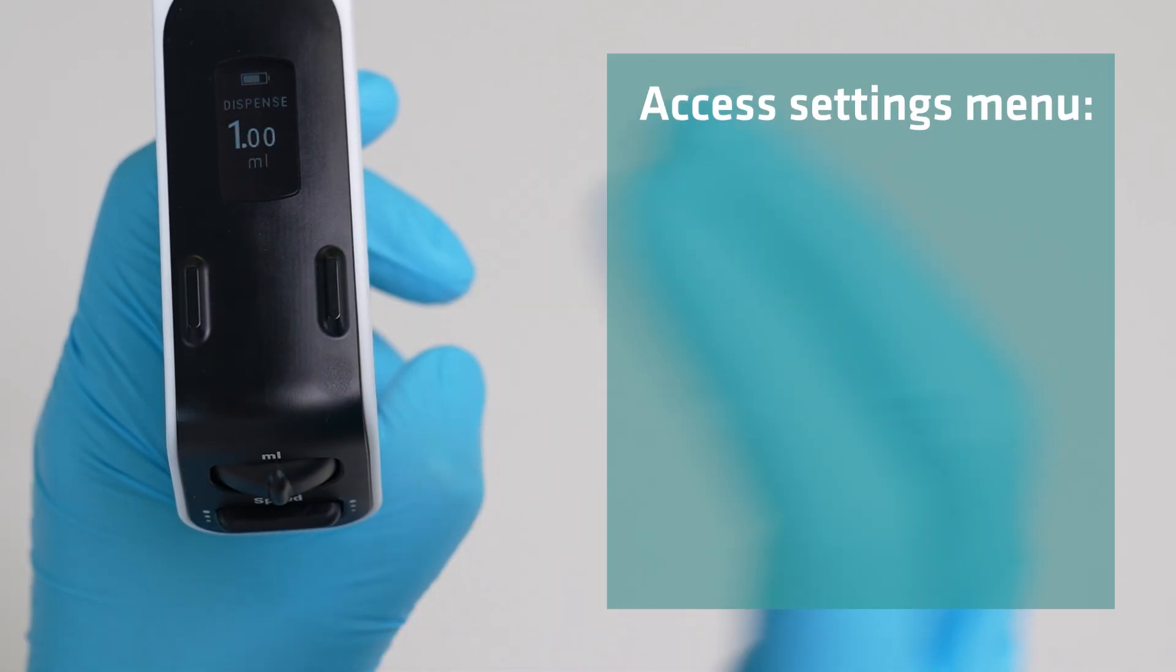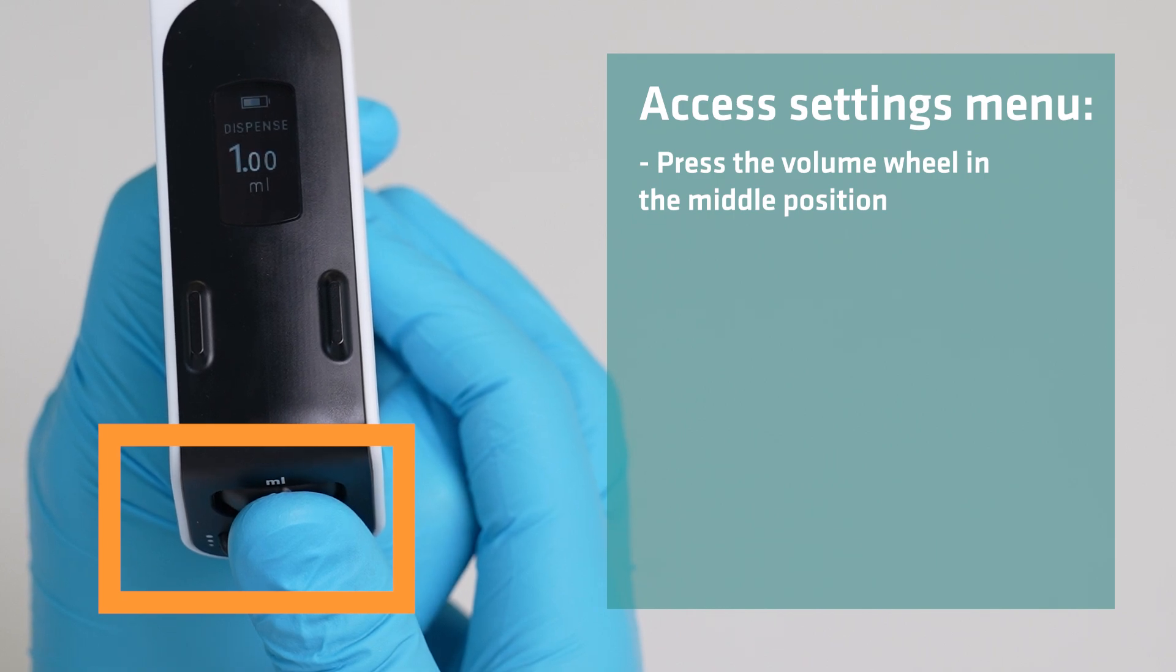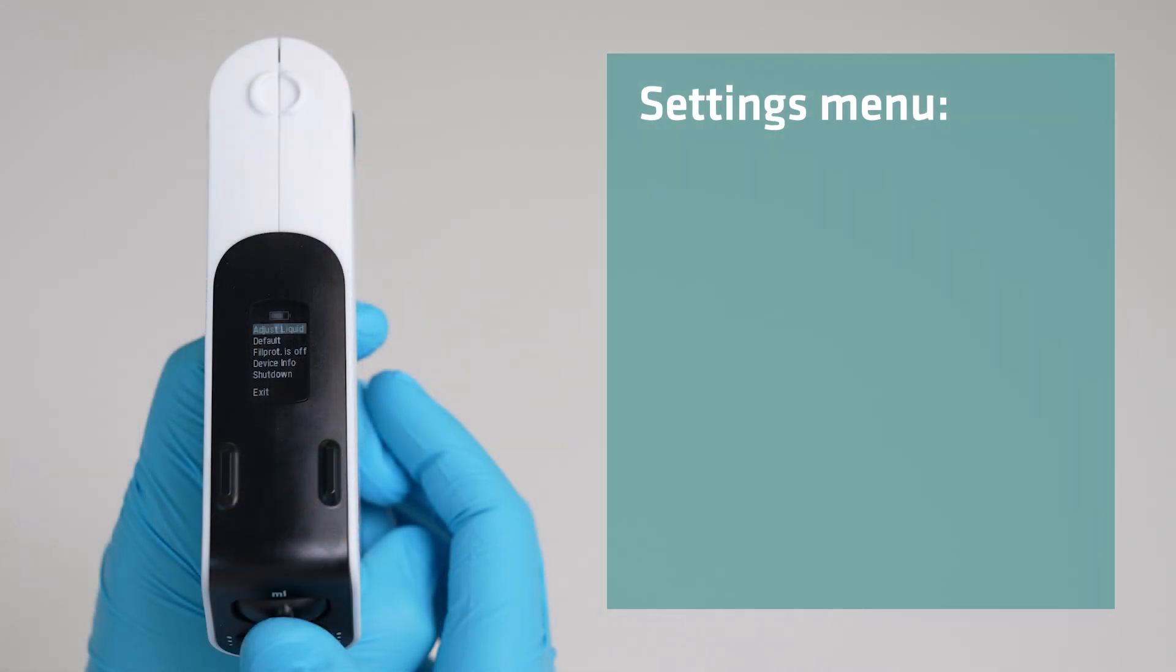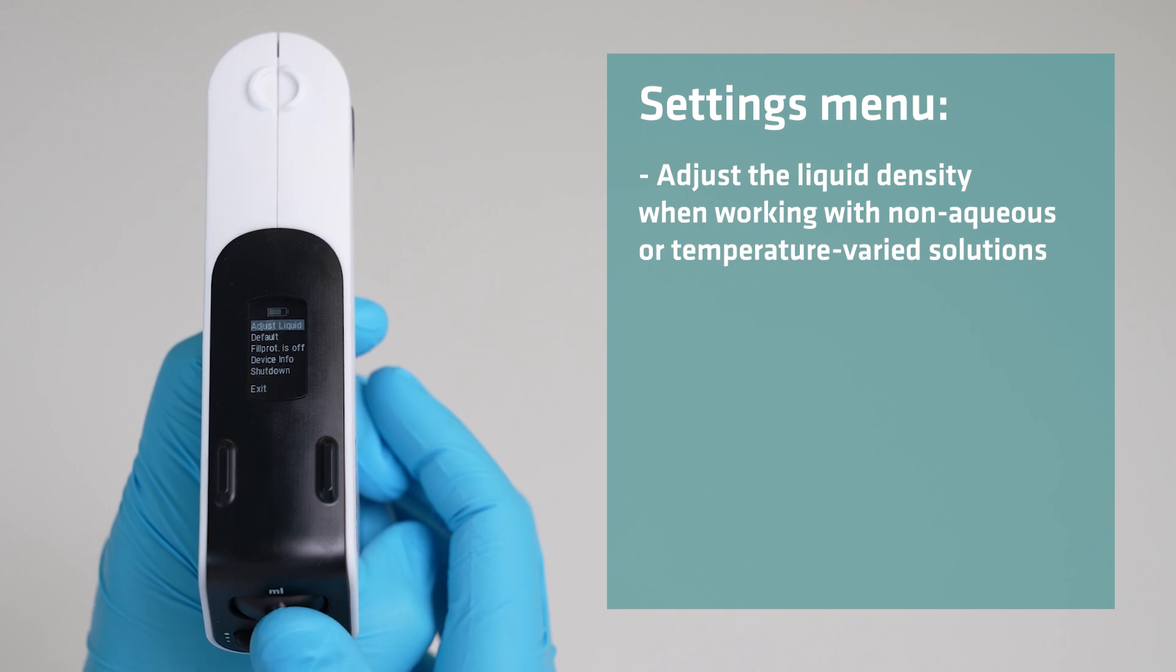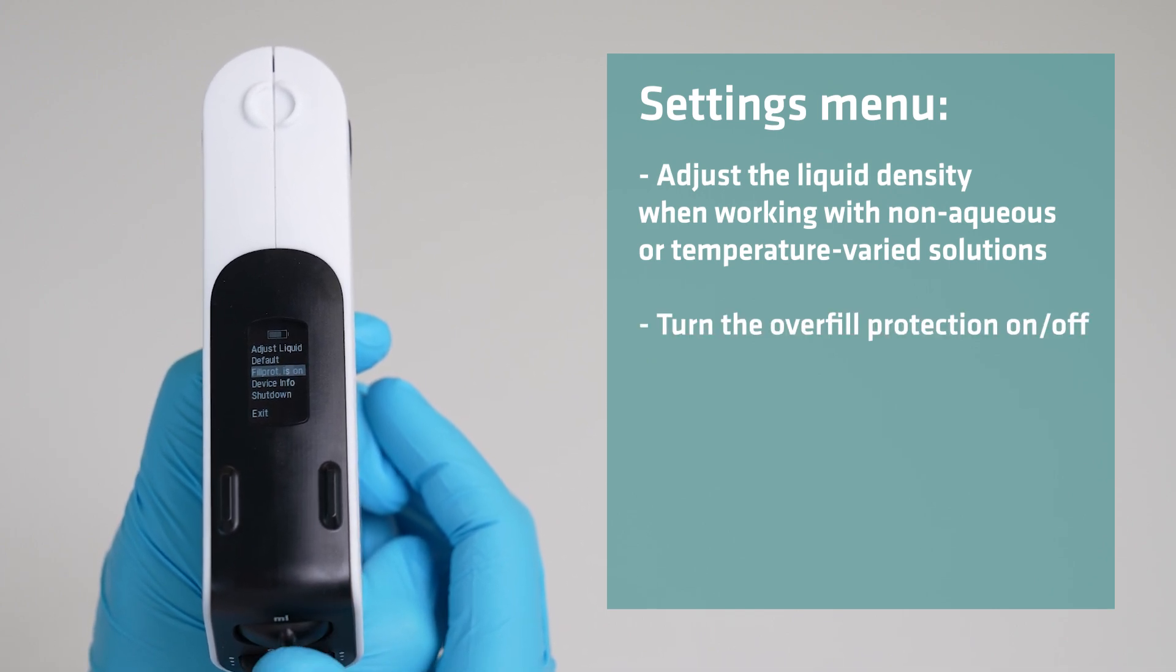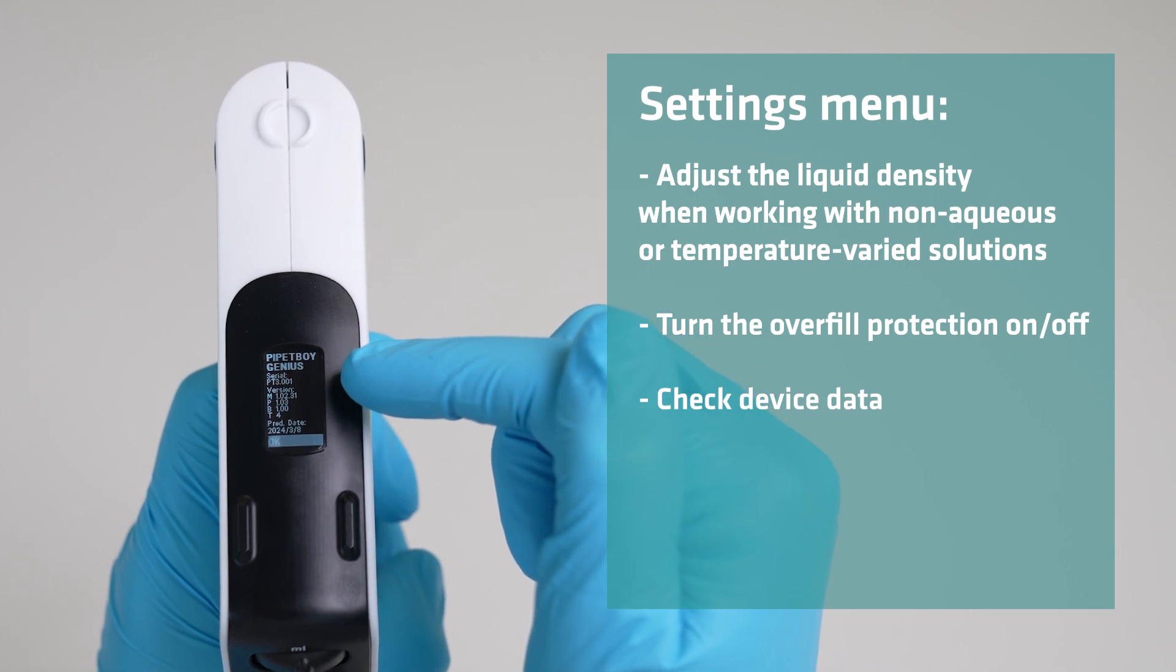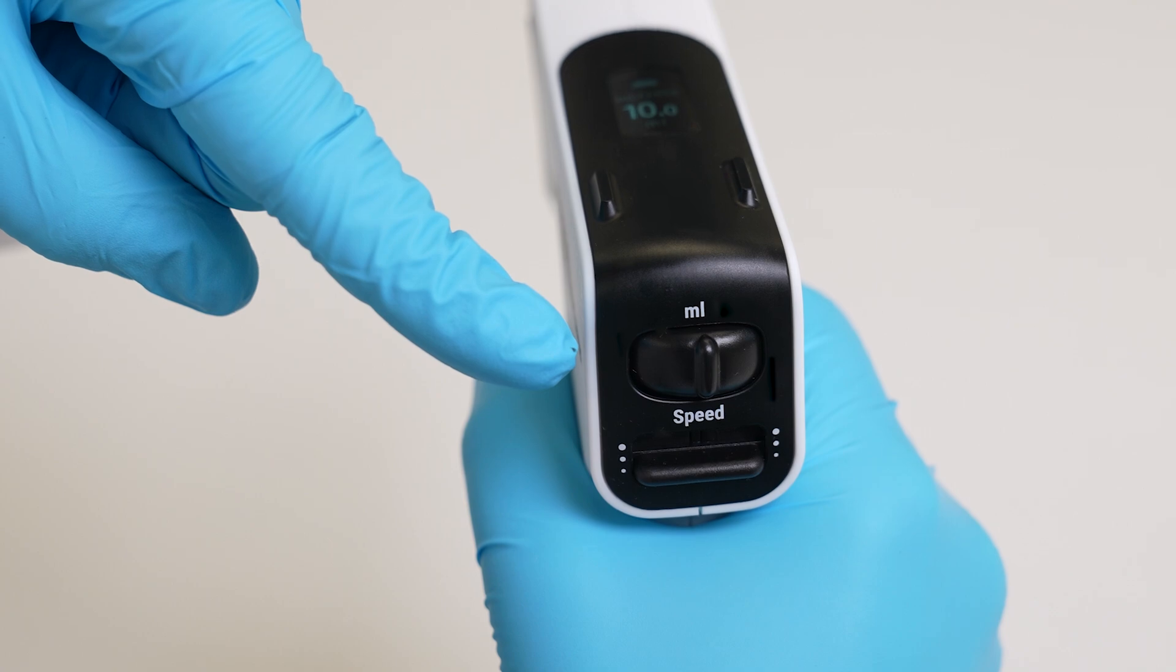Lastly, there's a settings menu that provides more access to the instrument. To access the settings menu, press the volume wheel in the middle position. In the settings menu, you can adjust the liquid density to improve precision when working with non-aqueous or temperature-varied solutions, turn the overfill protection on or off, check the serial number, or switch off the instrument. Use the wheel to navigate through the settings and press the wheel to select each option.